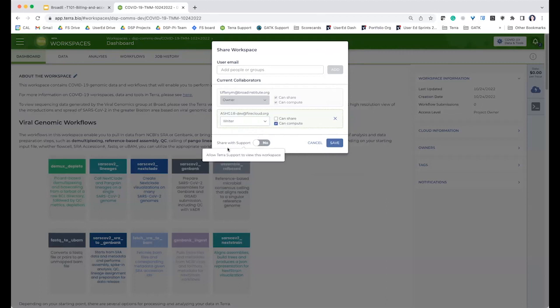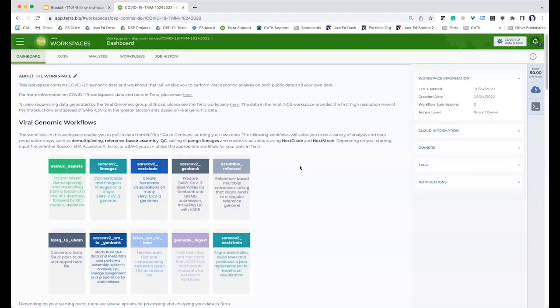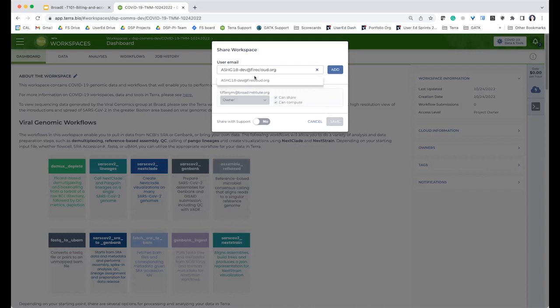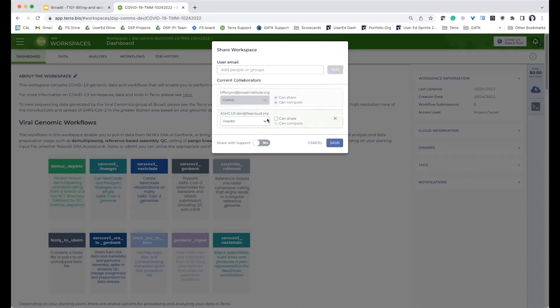Also, if you ever have issues, you can share with our support team by doing that, which is very handy if you're having issues. So I'm going to cancel that, but that's an example there. Tiffany, do you mind keeping that up just another moment, the share module? As an additional note for Joel's question, in terms of best practices, it'll be good to know what the role of each person in the collaboration is.